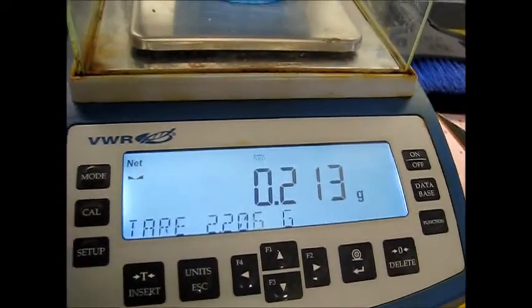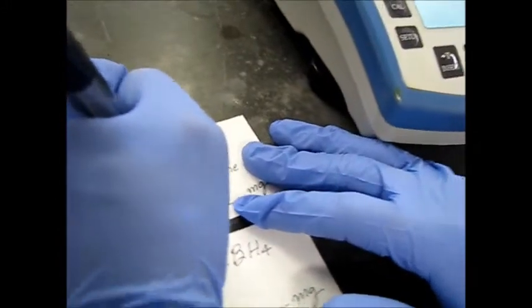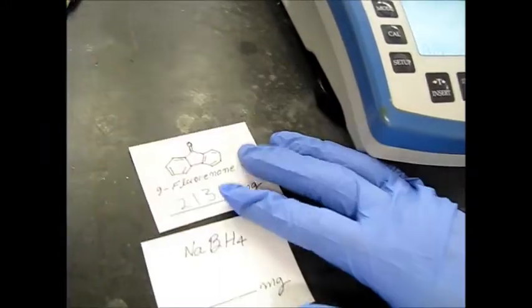So we do have just a little bit too much, but it's not so far off. So we'll go ahead and keep this mass. So we have 213 milligrams. So we'll write that right here, 213 milligrams, so we don't forget.